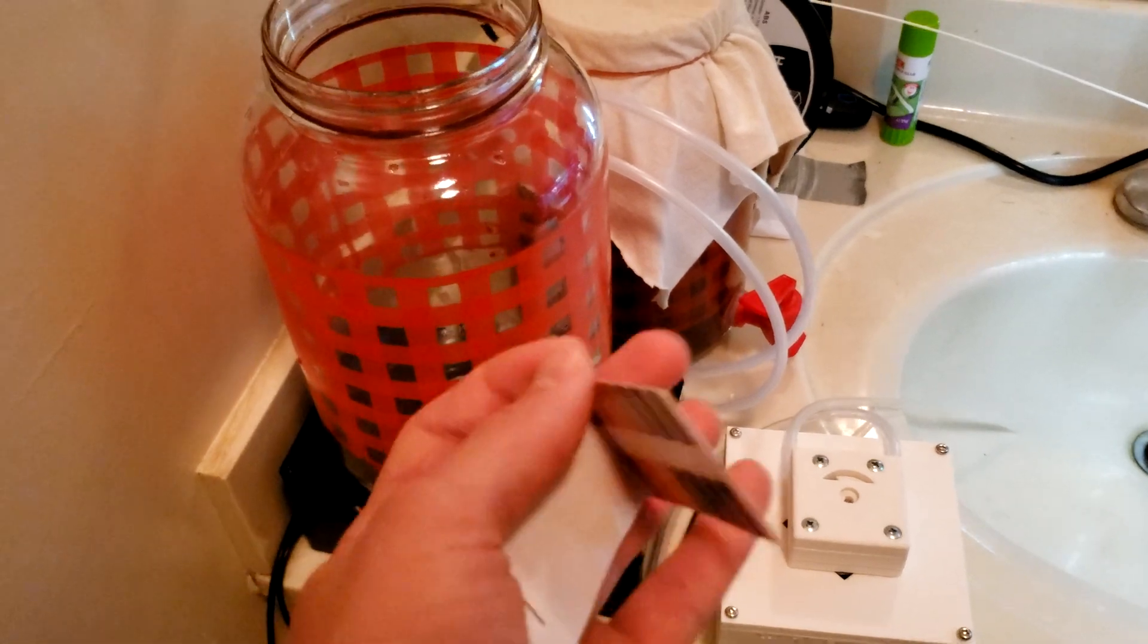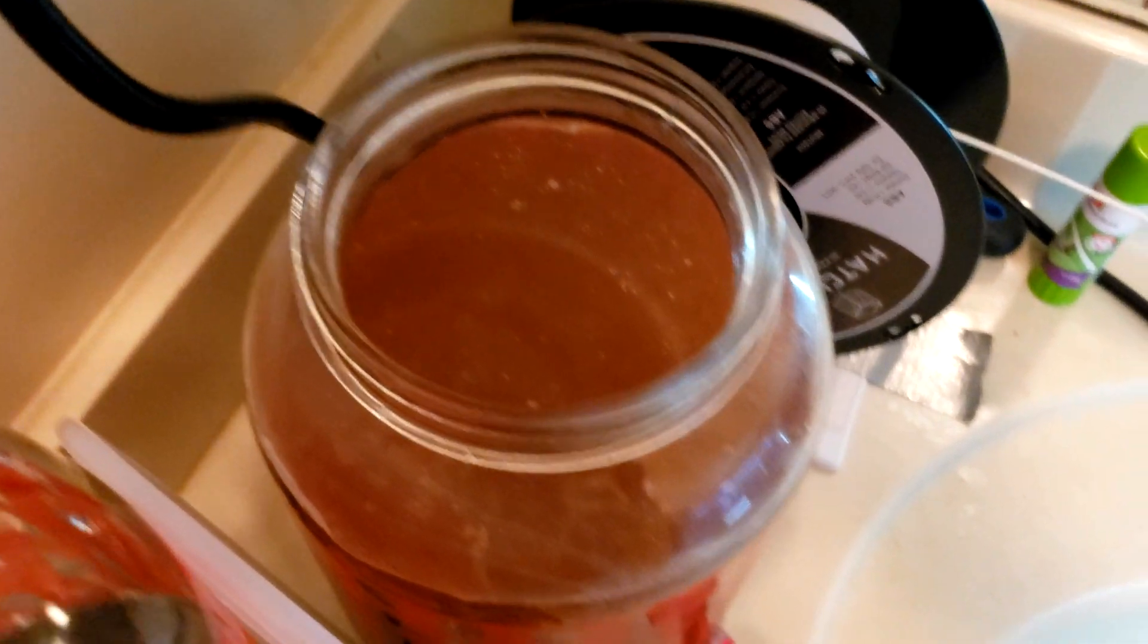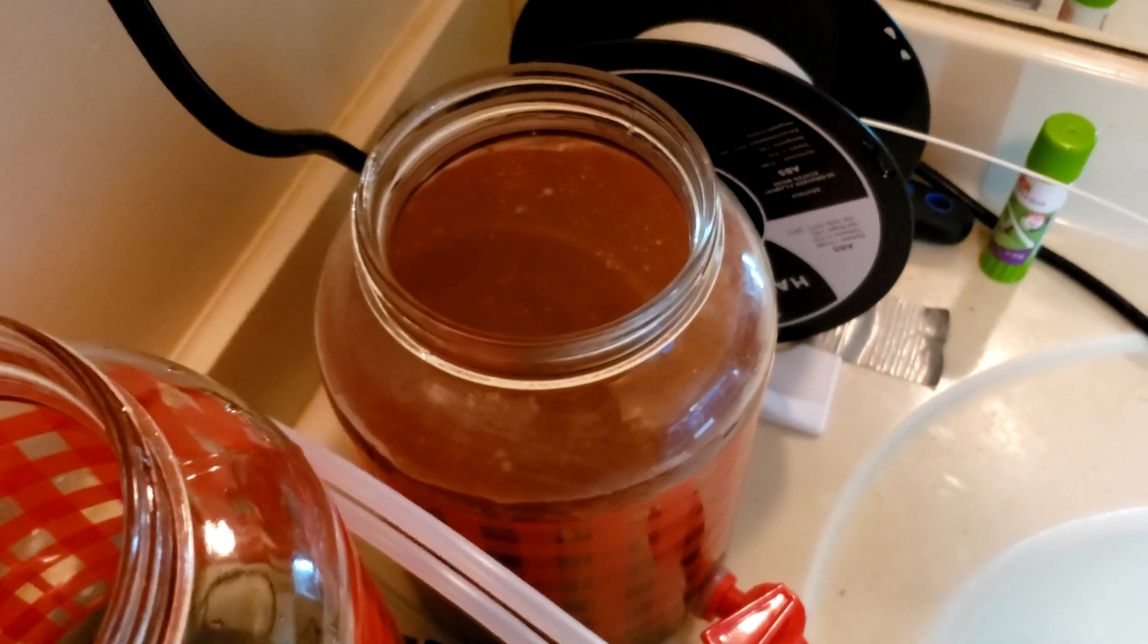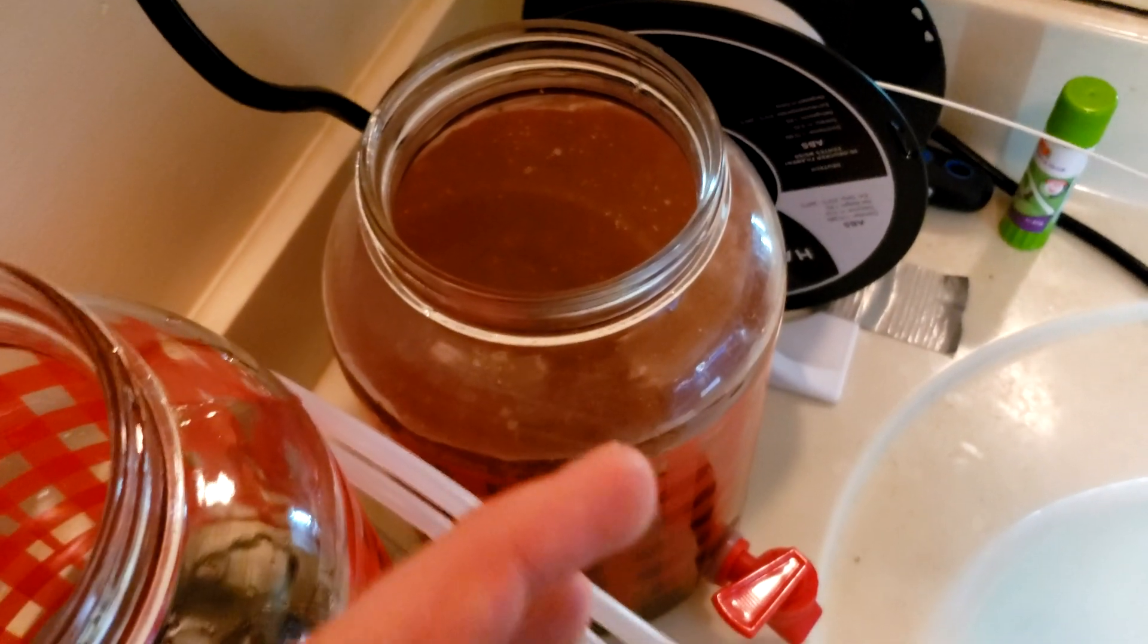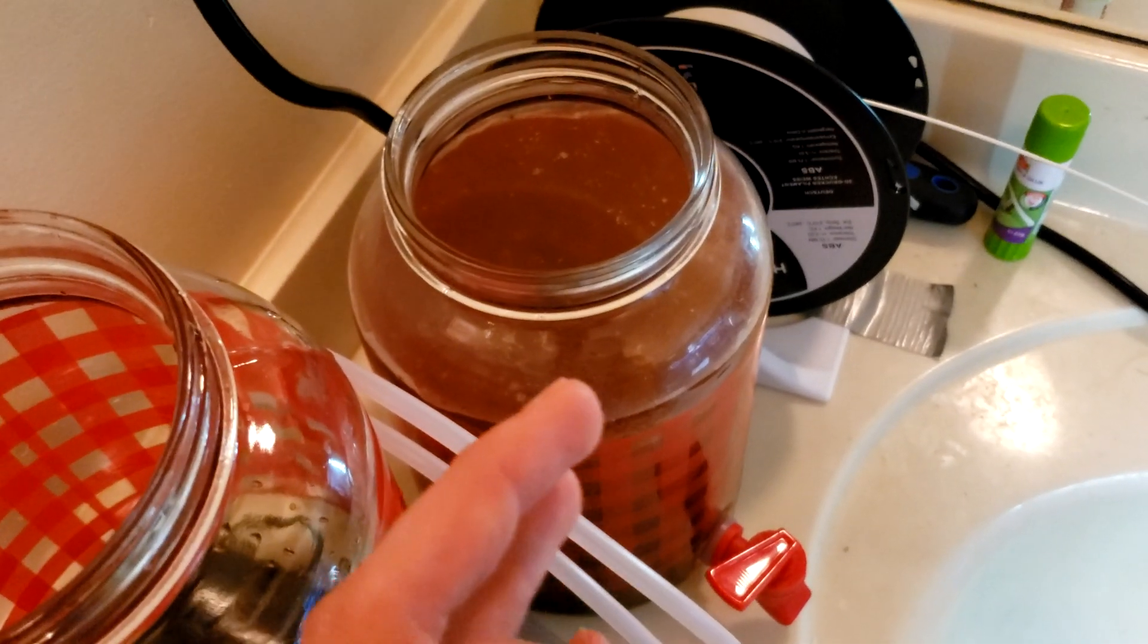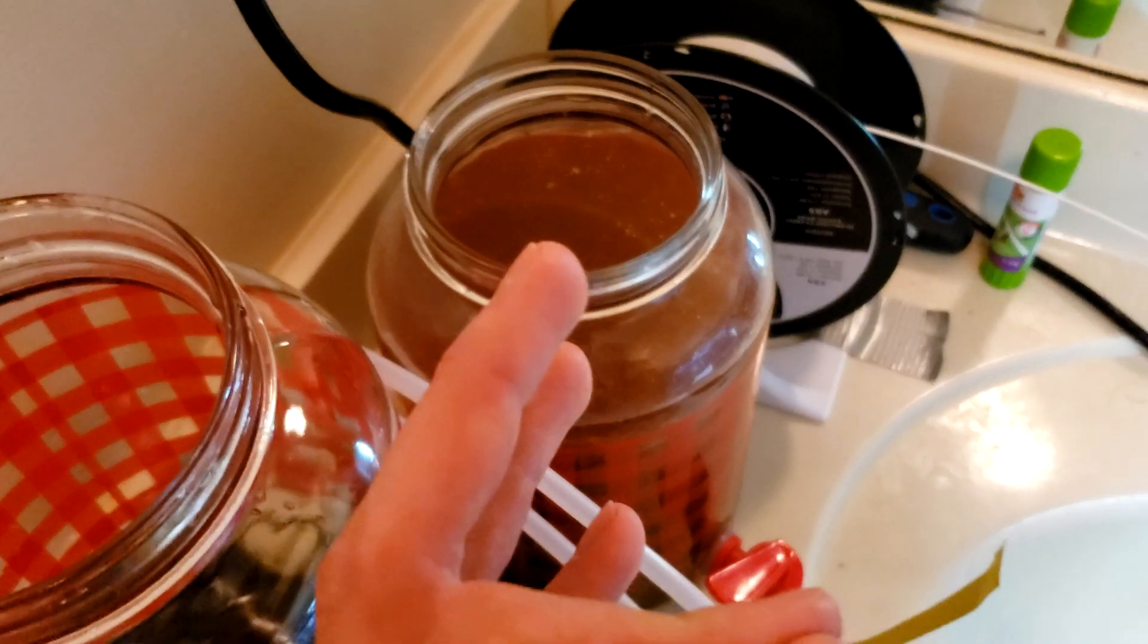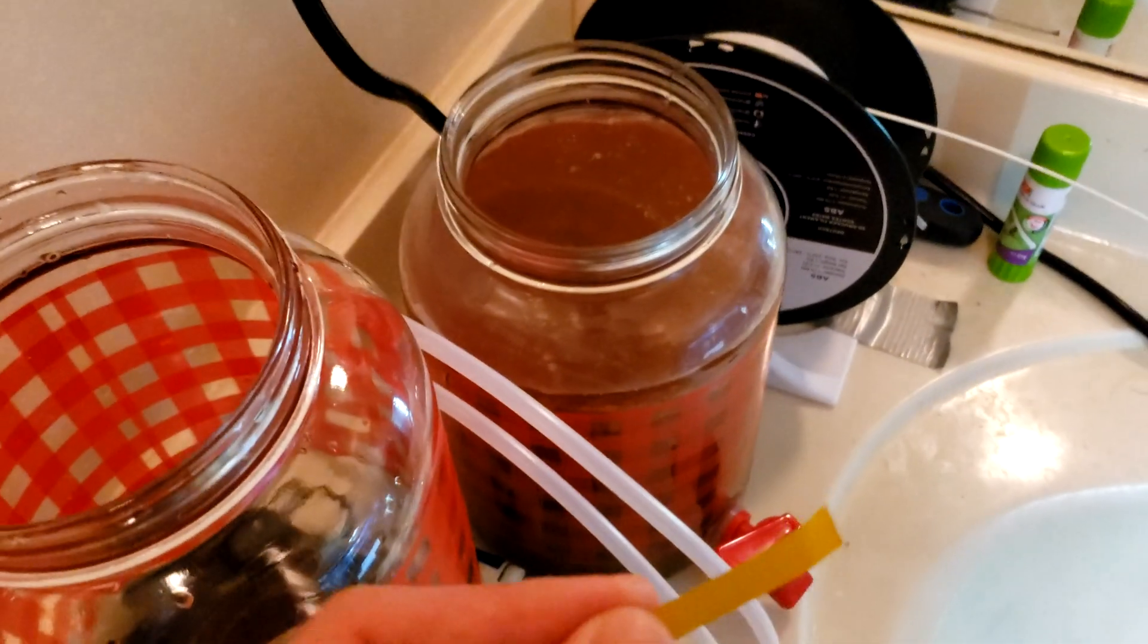So anyway, that's the theory behind it. I'm going to test the pH of this. So you see, we already have a scoby forming just a little bit. If you aren't familiar with kombucha, it's a colony of bacteria and fungi, usually yeast and acetobacter variety, but there's also several other varieties of organisms in the broth. The very basic mechanism is that the yeast turn the sugar into alcohol and then the bacteria turn the alcohol into acids, usually acetic acids and gluconic acid and other organic acids as well.